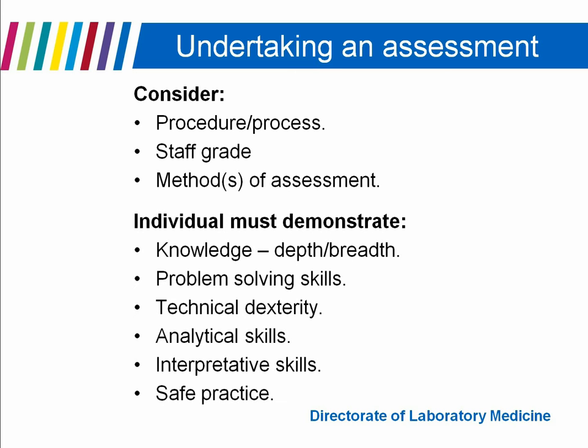And there are a number of attributes that you want to cover, so you want to know if the individual demonstrates the knowledge, depth and breadth of experience, what their problem-solving skills are, do they have the technical dexterity, the analytical skills to carry out the flow assays, and interpretive skills as well as being safe to practice.